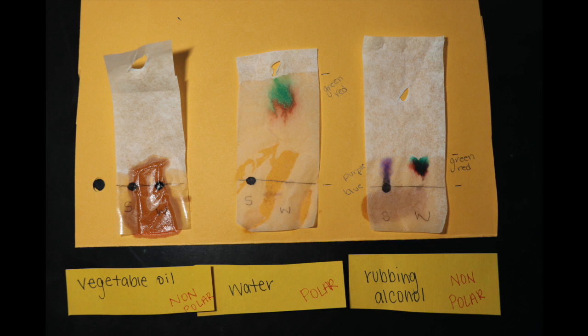What scientists will do with this information is they will do an analysis of color. So for example, in the middle strip, we can tell that the green pigment in the washable marker is more polar than the red pigment because it travels further up the paper. And so these are a couple of things that scientists might look at while they're doing paper chromatography.